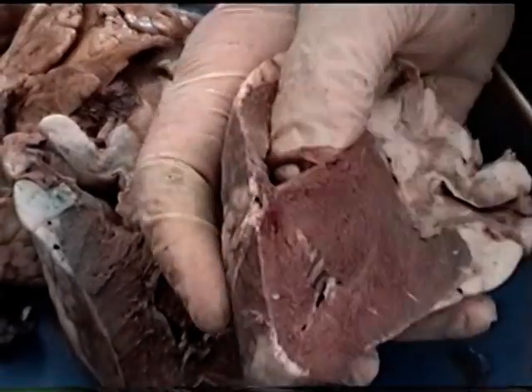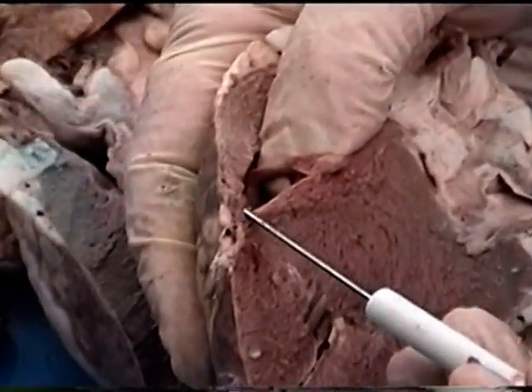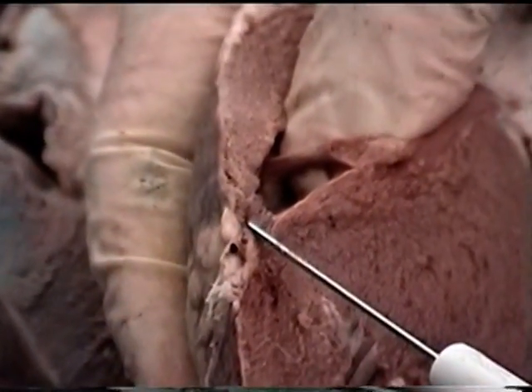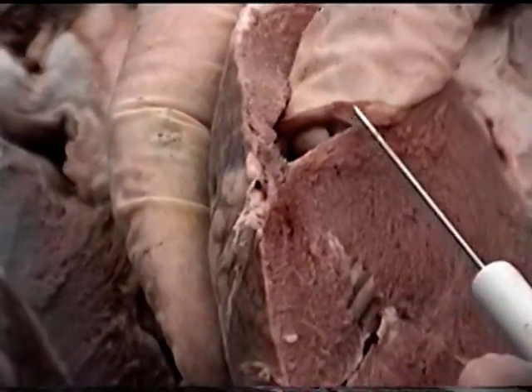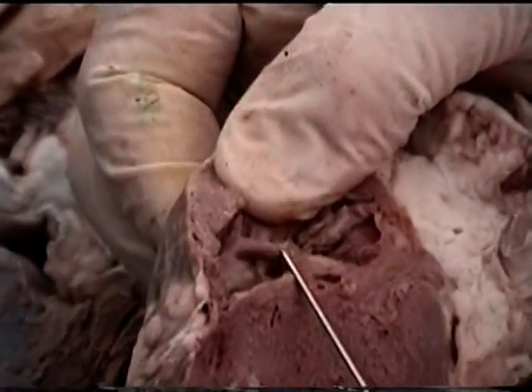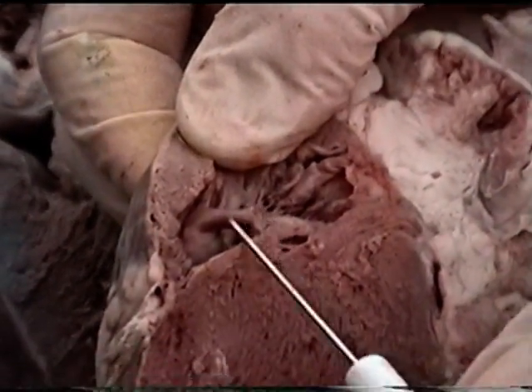And like when we were talking about the heart model, remember that the thinnest point in the myocardium is at the end of the right ventricle. So to prevent that from being overstretched, we have a band of muscle that runs right through the right ventricle. So what we can see here clearly is a moderator band, which is a real cool thing to be able to see.